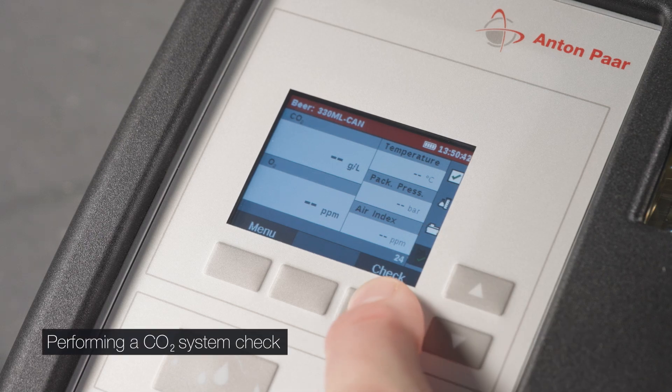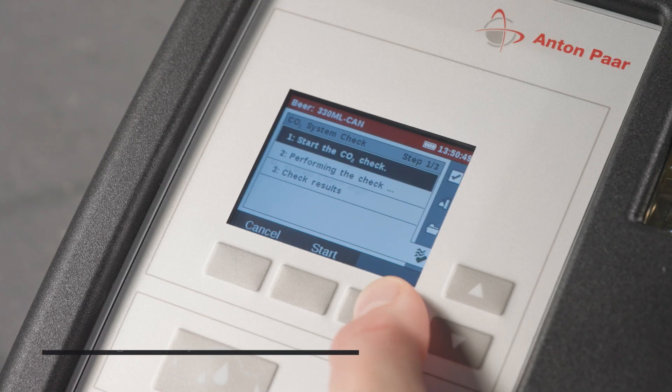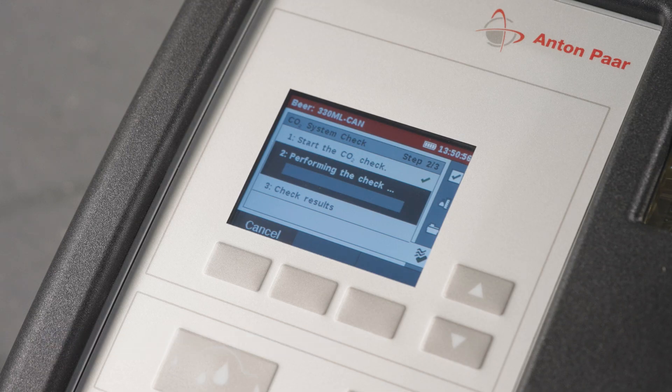Perform a CO2 system check before you start your working day. The check verifies the zero point of CO2 and measures the chamber tightness. If you are using a PFD, fill purified water at room temperature, free of CO2 and chlorine, in a clean 500 milliliter PET bottle.